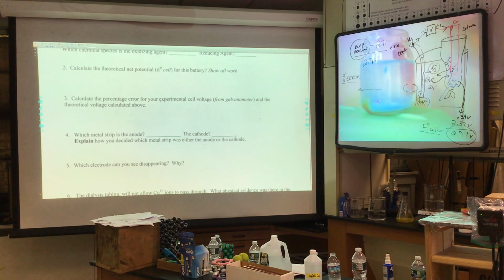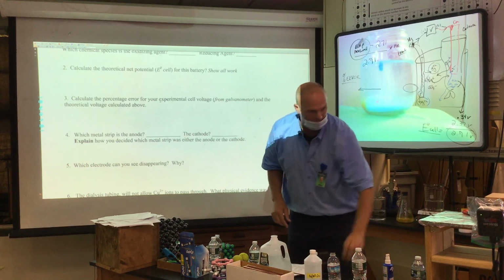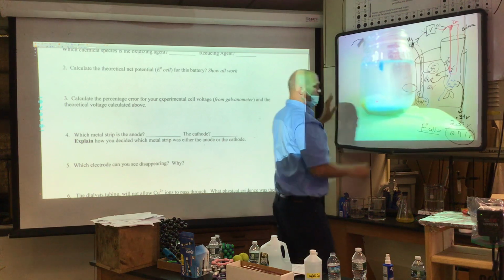So there's my electrode. And you can see how it's bent. I can hold it this way now. You see how it's bent? Because it was what? Sticking out. Why is it so short? And I'll just kind of put it there so it can stay there. Can I even see it? I can't even see it. Sorry, I'm talking and assuming you guys can see it. Okay, hold on. And I need to focus, right?